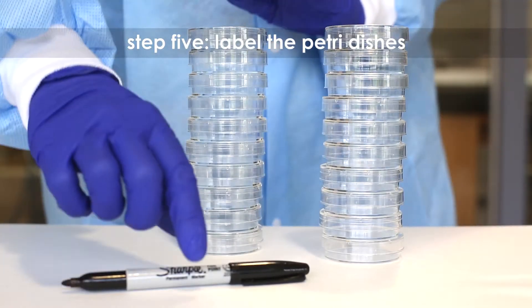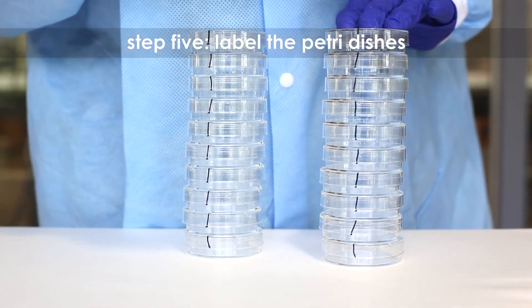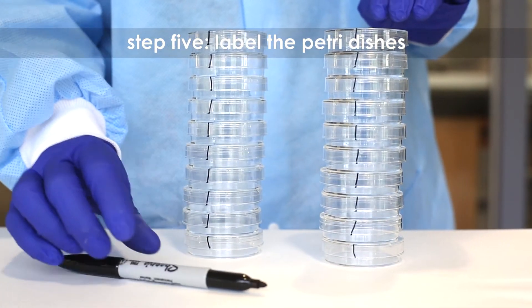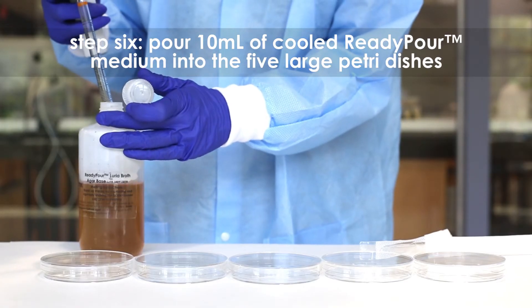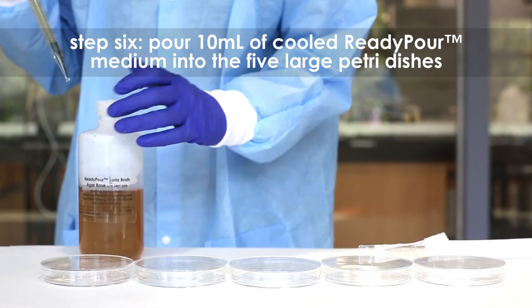Step 4: Cool the ready-pour medium to 60 degrees Celsius with careful swirling to promote even dissipation of heat. Step 5: While the medium is cooling, label the petri dishes. Consult your protocol for specific labeling instructions.